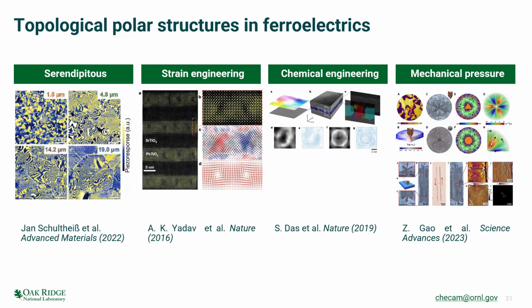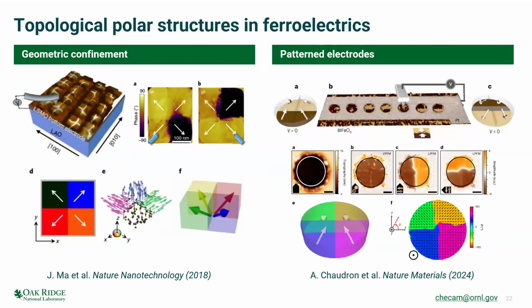They've also been shown to appear under mechanical pressure, or even geometric confinement, like these nano islands that form these center-convergent and center-divergent type domains.